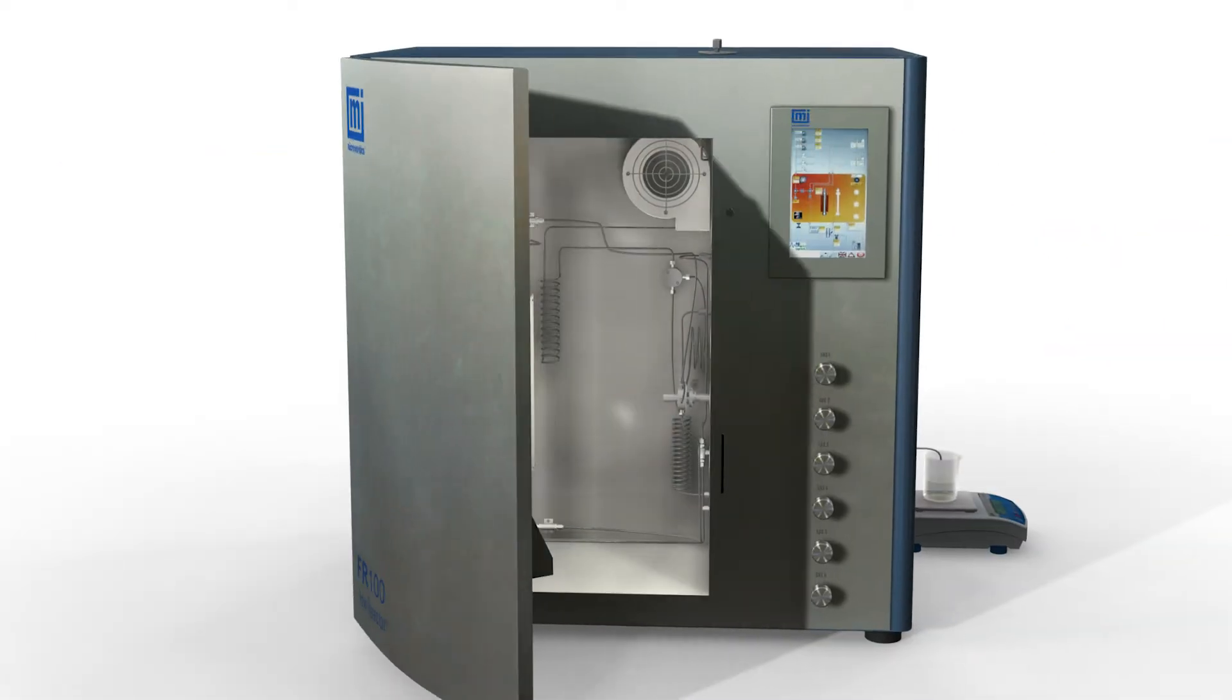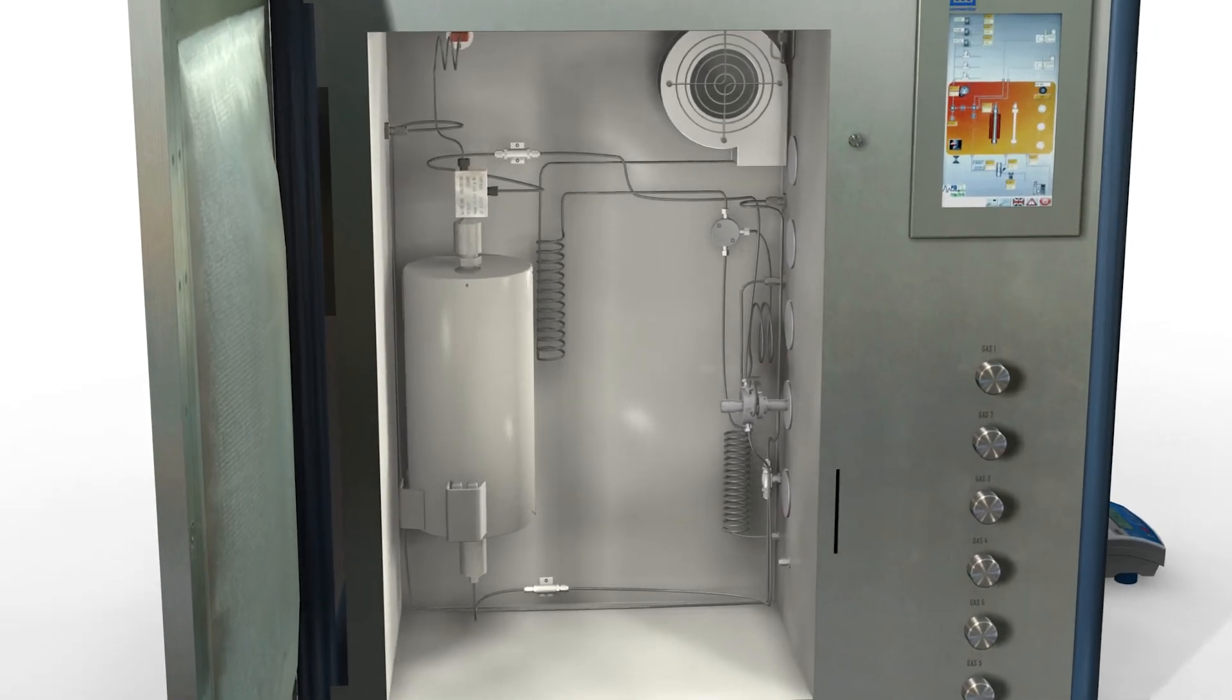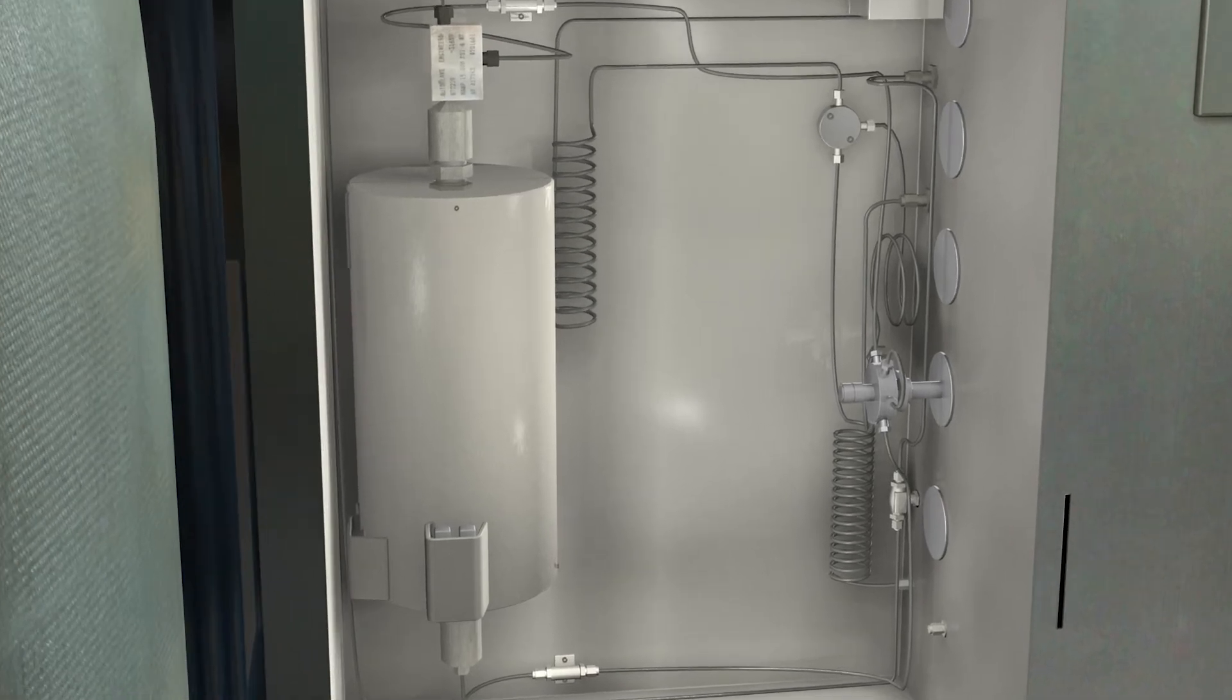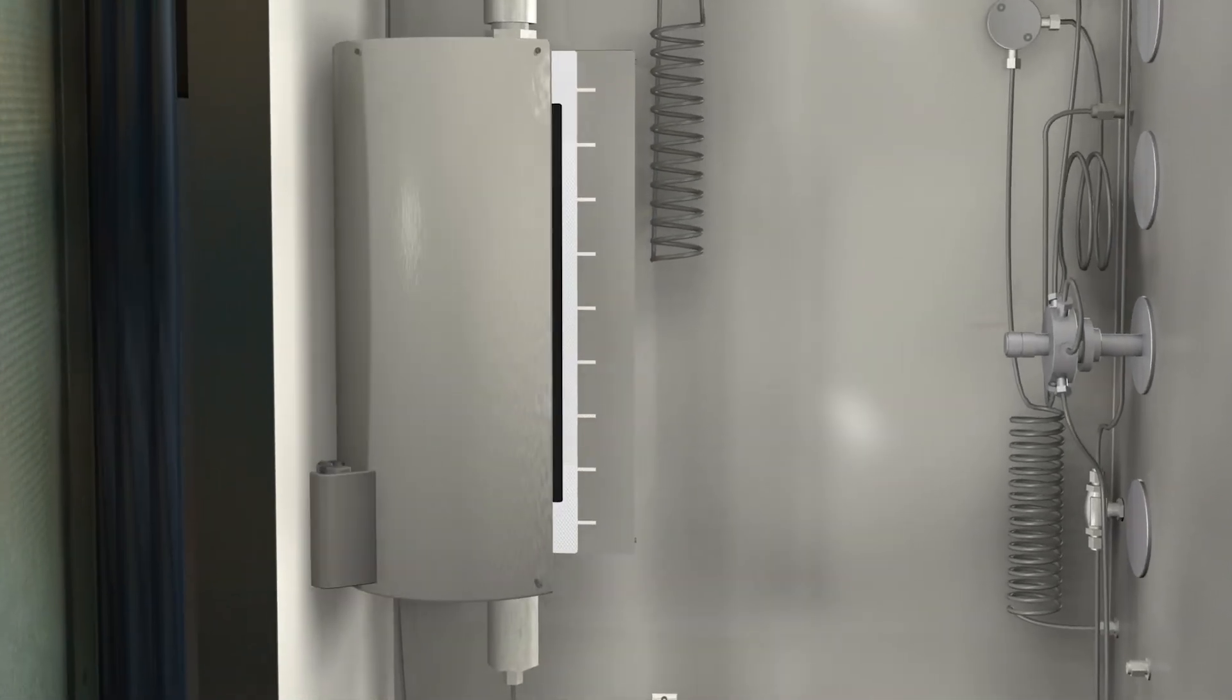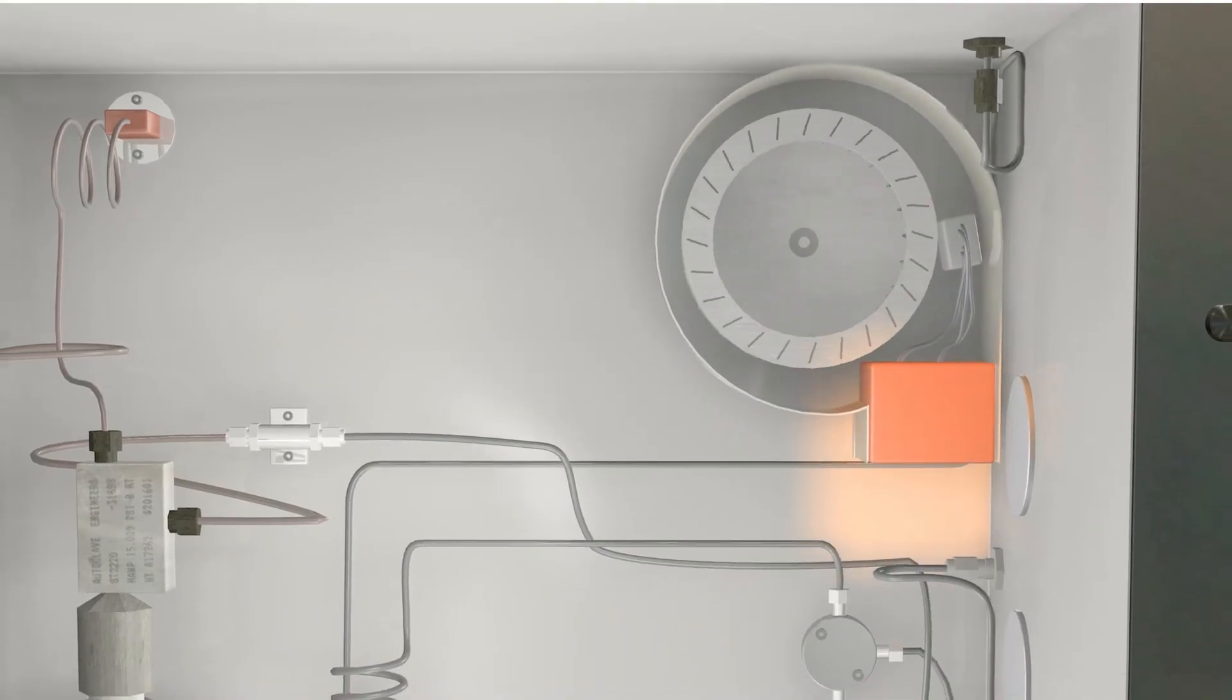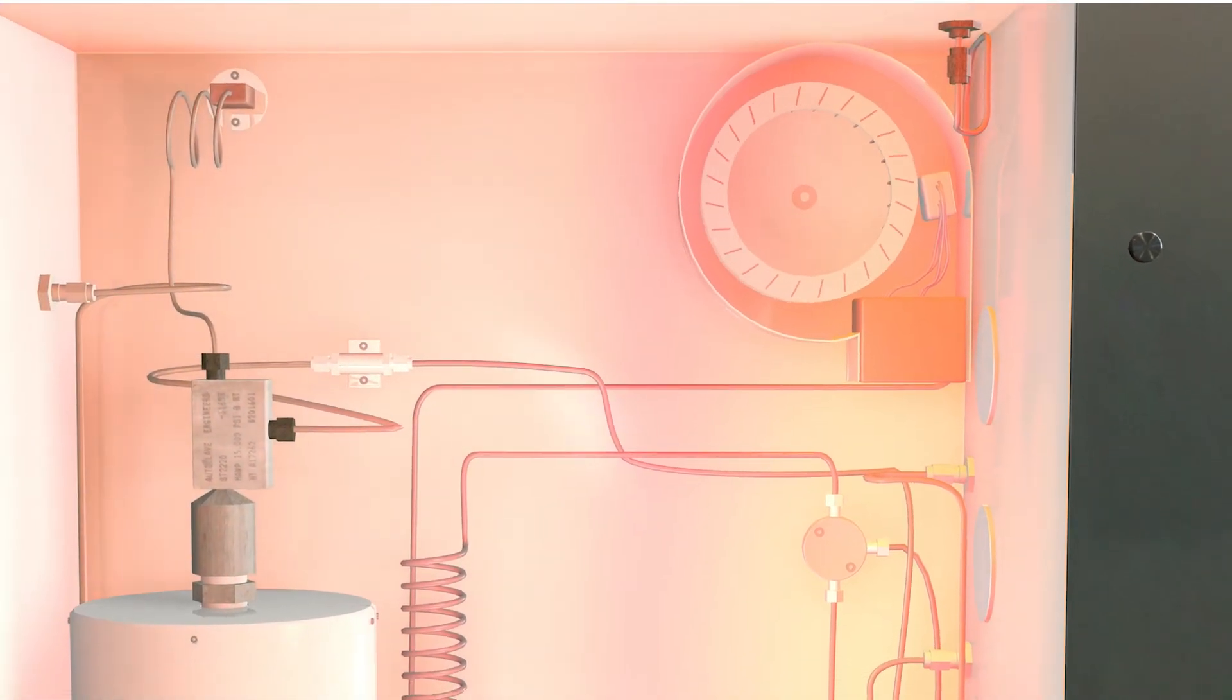Let's take a look at how this revolutionary system works. The FR100 supports the introduction of both liquid and gas feeds. A HPLC pump delivers liquid to the thermostated environmental chamber. This temperature-controlled chamber eliminates cold spots and prevents condensation to ensure unparalleled flow stability.